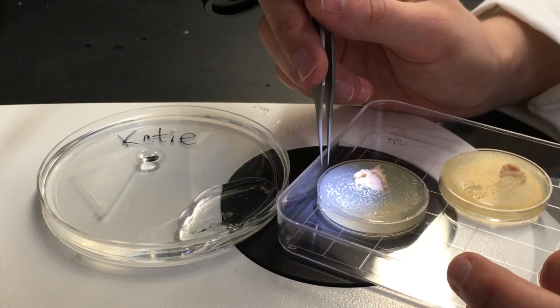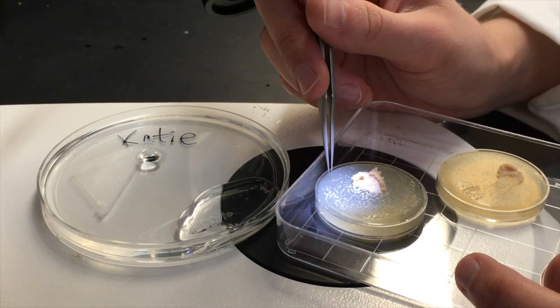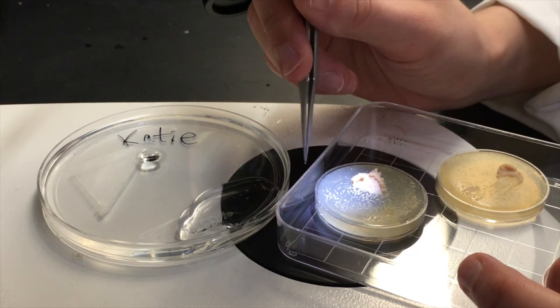Place your collection cap next to your dissecting dish under the microscope. While looking through the microscope, use your forceps to gently pick up individual larvae and place them into the saline. You might want to pick up about 10.